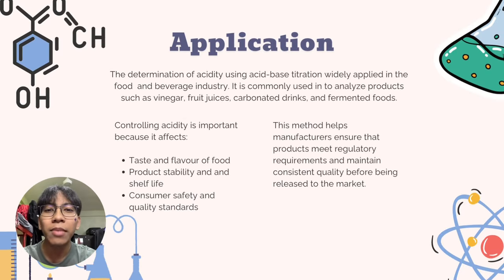Application. The determination of acidity using acid-base titration is widely applied in the food and beverage industry. It is commonly used to analyze products such as vinegar, fruit juices, carbonated drinks, and fermented foods. Controlling acidity is important because it affects the taste and flavor of foods, product stability and shelf life, and also consumer safety and quality standards. This method helps manufacturers ensure that products meet regulatory requirements and maintain consistent quality before being released to the market.